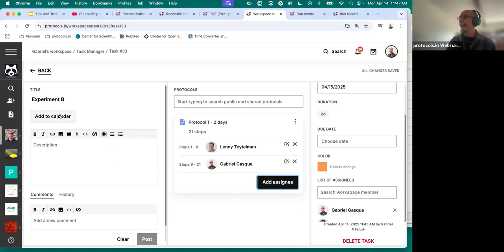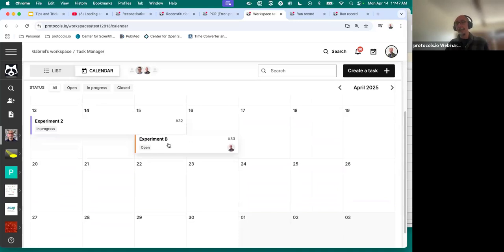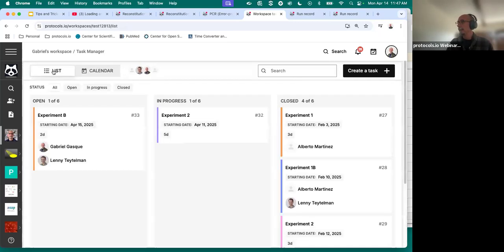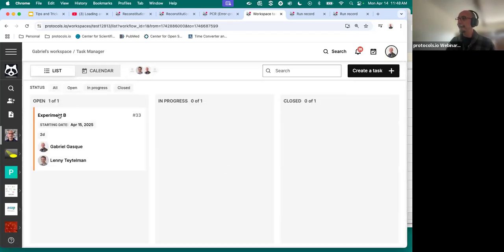And if I go back to the calendar, you will see that a new task was created here. I can go to the list and see the open tasks, those in progress, and those that have already been closed. I can just select to see the open tasks.